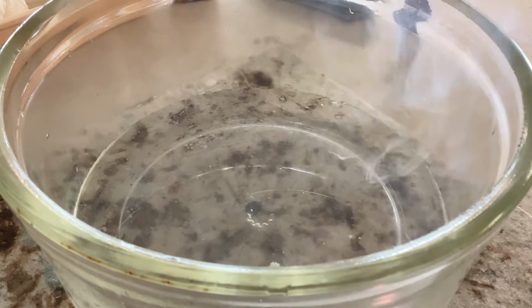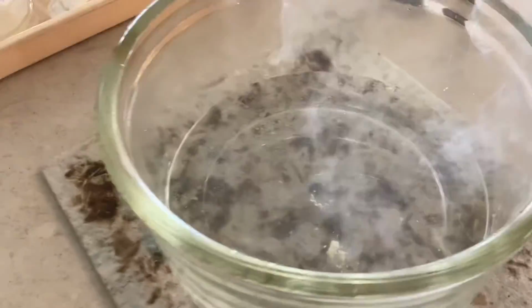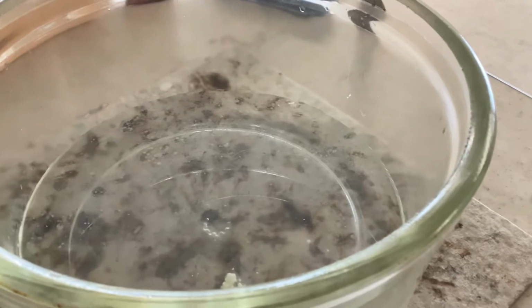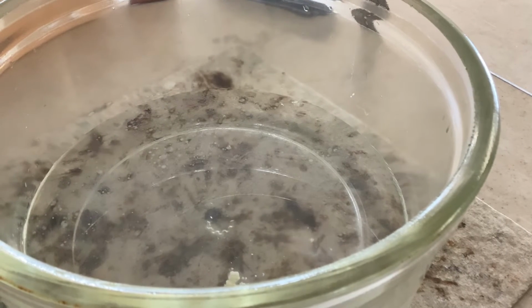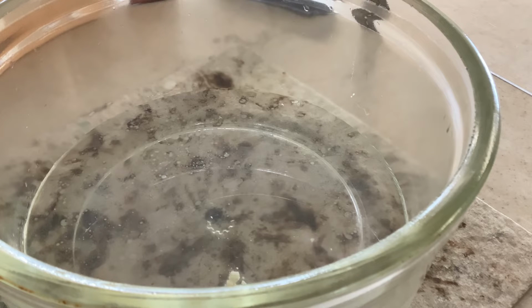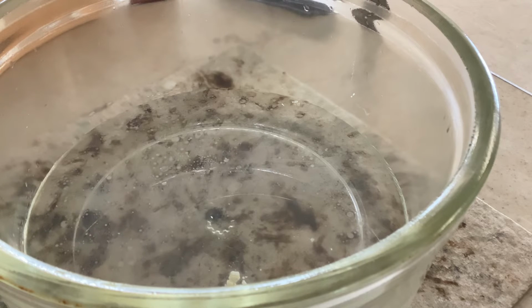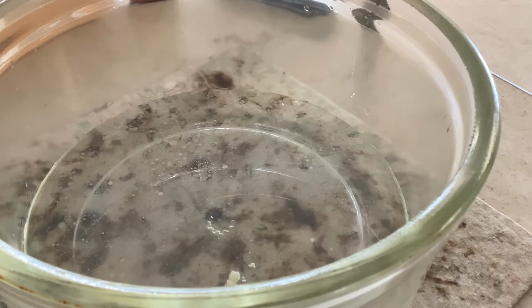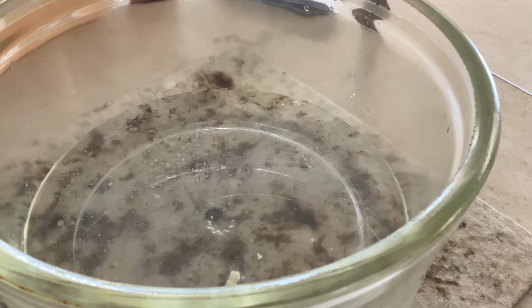And this time you can see that it disappeared already. Because its reactivity is much higher than that of sodium, it reacts quite vigorously. And maybe I show you another one, and you can compare the rate of reaction and the corresponding reactivity by comparing with sodium or calcium.